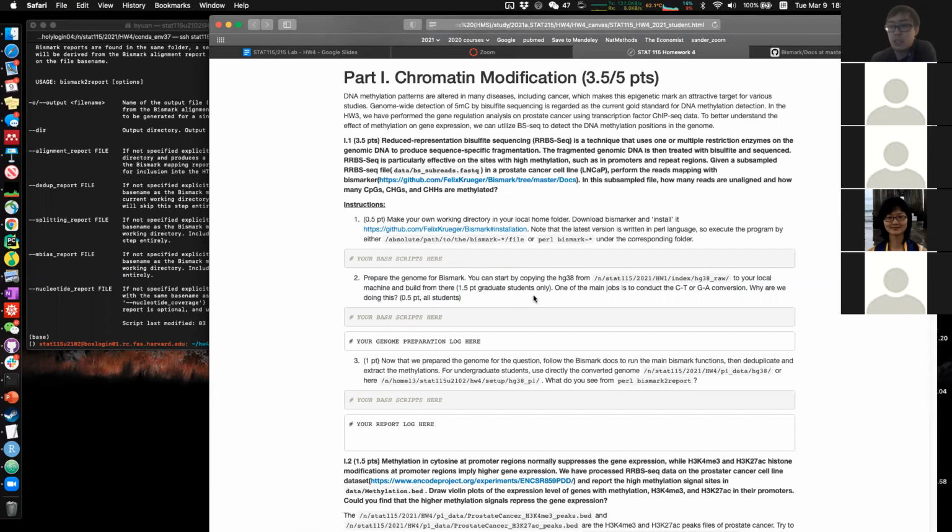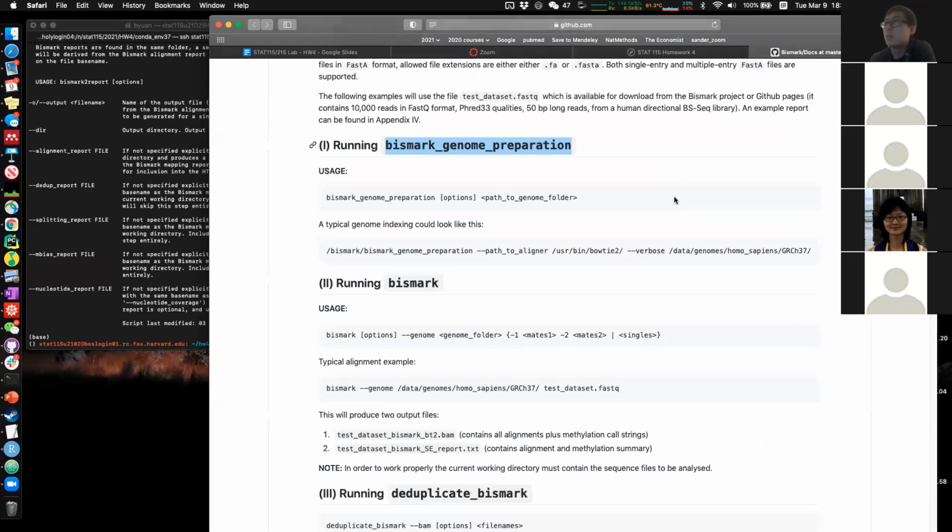We put it here as for graduate students only, but for undergrad students, we also highly recommend you try it out, to check what is really going on, what Bismark is really working on. Just to give you guys a hint, the entire software is pretty well developed and well maintained, so you can directly use a single command and that gives you the preparation.